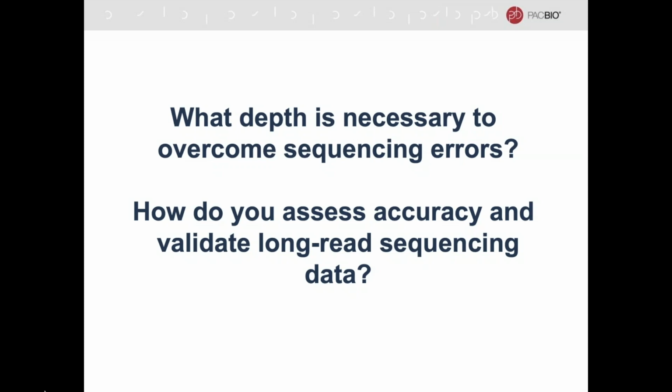So as Michael mentioned, short read validation, or any other orthogonal validation, is how we would really confirm, if needed, that this was here. I think also, you are doing single molecule sequencing, so these are phased single molecules of DNA. So seeing it in multiple different molecules, sampled multiple times within an extensive run, is also a nice way to validate in an internal fashion.